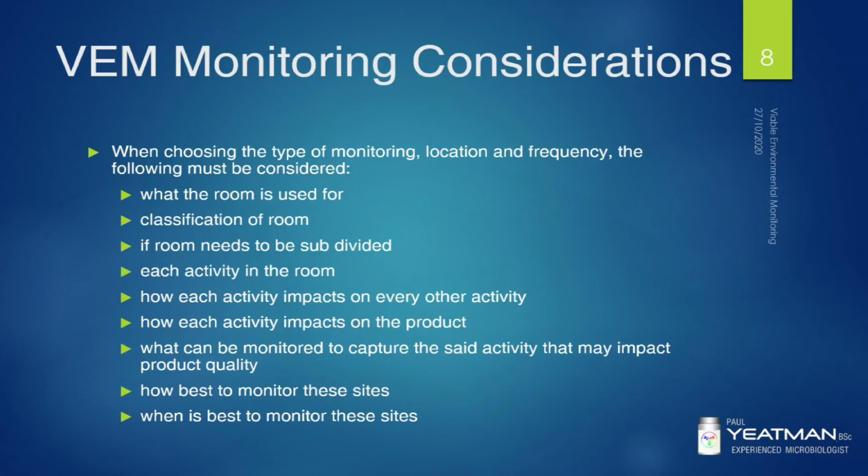For a non-sterile product, the viable environmental monitoring requirements are less regulated and it is primarily left up to each manufacturer to determine what and how to monitor. Your site may monitor the air in various production rooms once a month and also take surface samples in the room deemed to be worst case. So that might be a preparation room, or it might be the filling room that makes the product that contamination in would potentially be worse than another product.